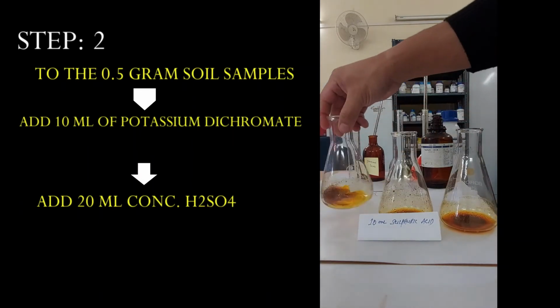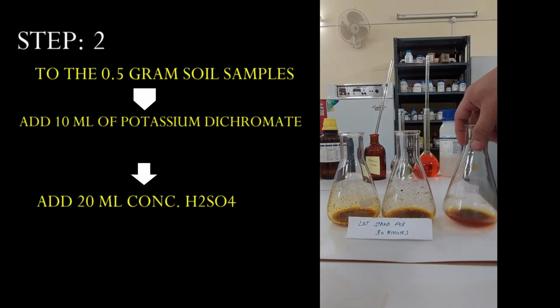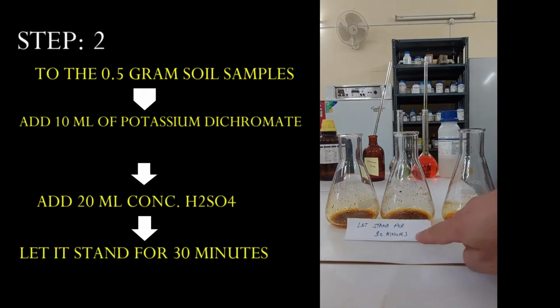Then after the addition of sulfuric acid, let the soil sample stand for 30 minutes.